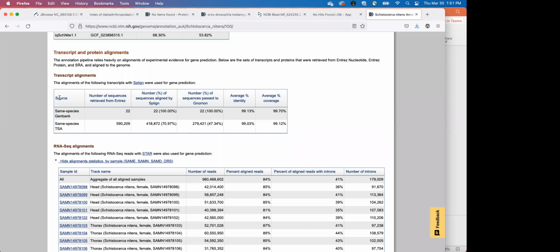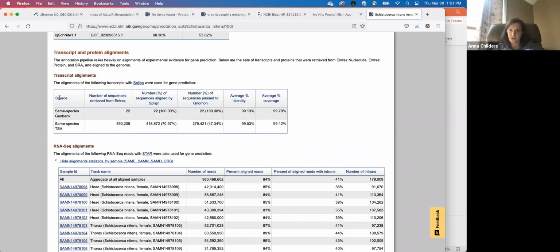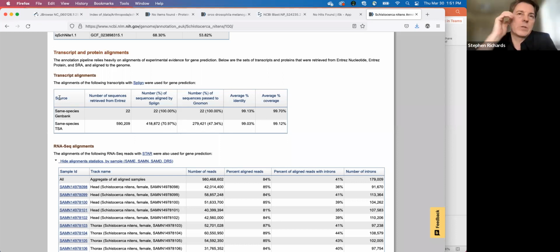Yeah. So if you're going to do a tree, I'd suggest you use the longest one. Or you use all of them, and then you can stick them all in the tree if you wish. And then hopefully by this process, we would have found paralogs or orthologs, depending on how we feel.